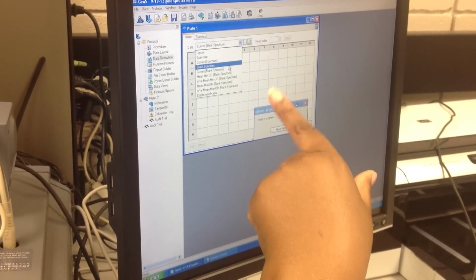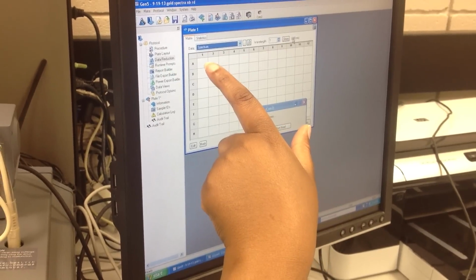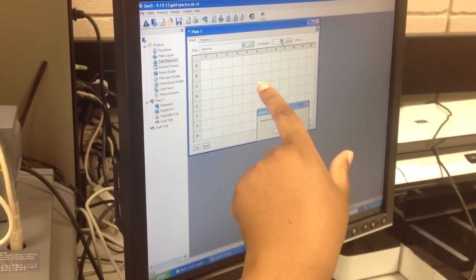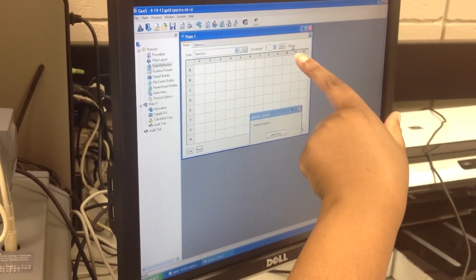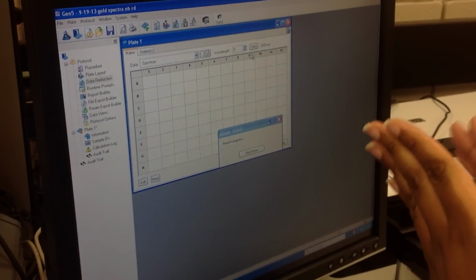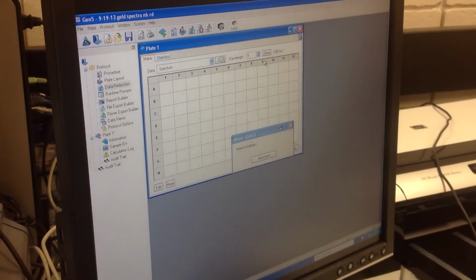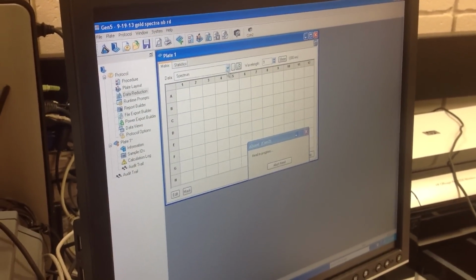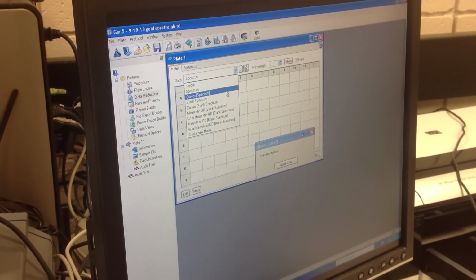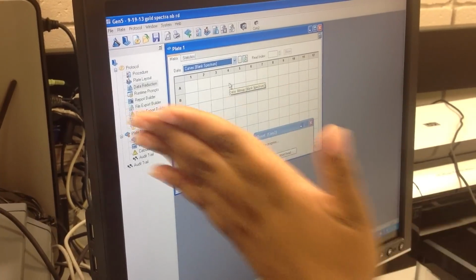If you go just regular spectrum, that's going to give you a series of numbers, and you can tell it, okay, show me the absorbance at whatever nanometers are specified over here to show you what the absorbance is there. And that's good for when you want to compare several samples to see what the absorbance is at each sample at one specific wavelength if you want to compare. So you could just have them all displayed at one wavelength, etc., etc. But what I like to leave it on is curves blank spectrum, and when it finishes all of them, it's going to come back and pop up.